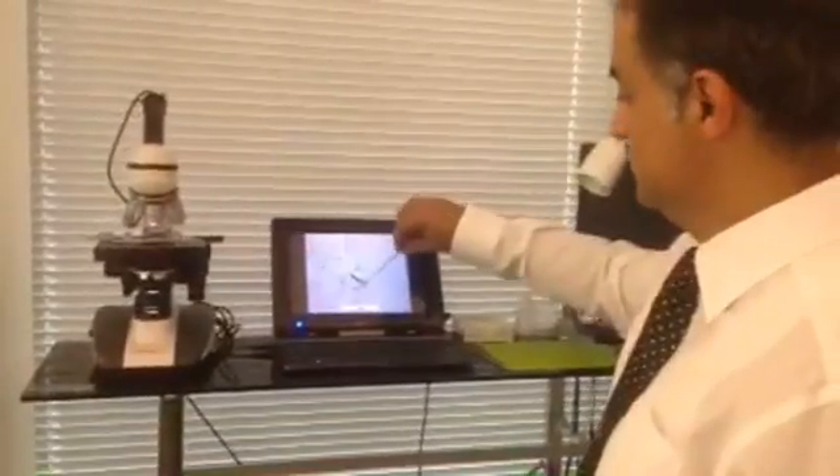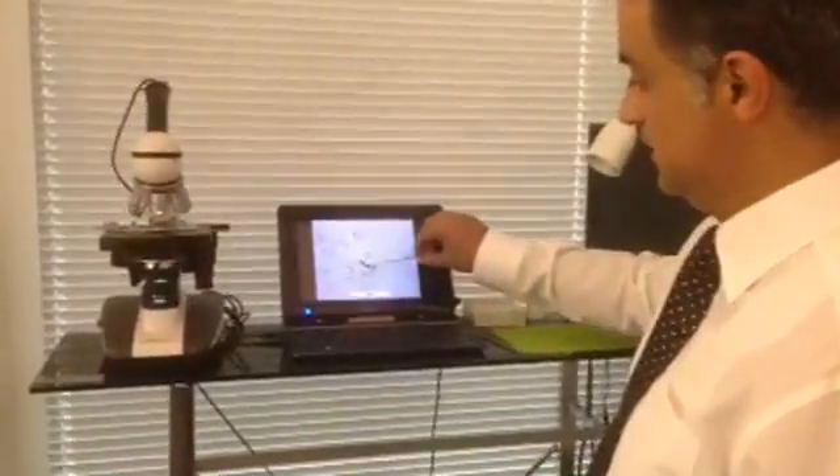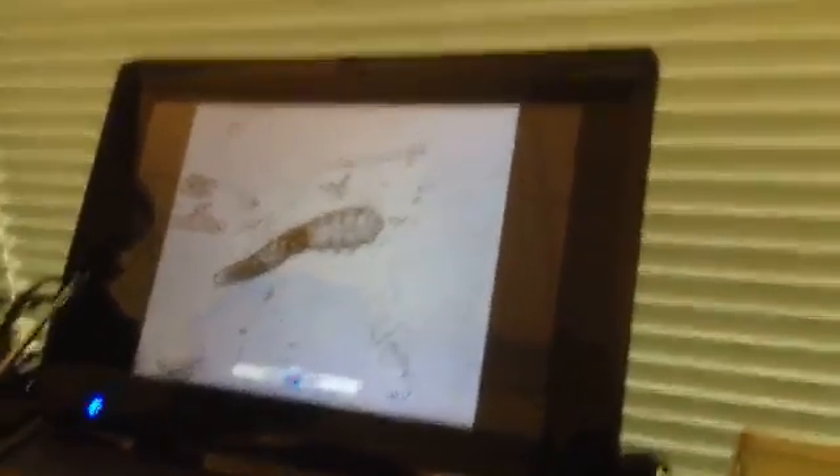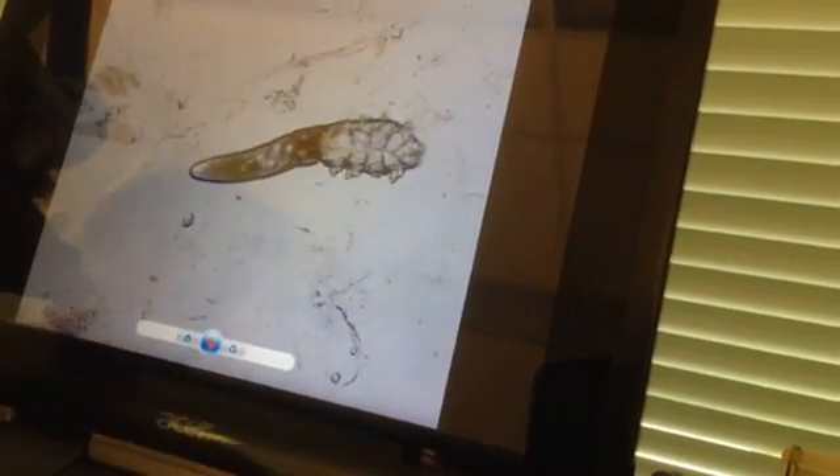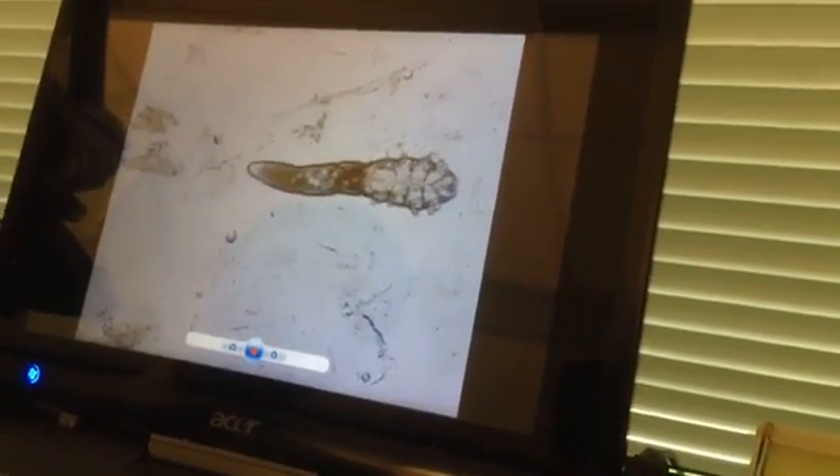From the scalp of one of my clients that's moving now — you can just see that eight legs, and they're trying to hit the seven. You can see how fast the stomach tries to walk with eight sharp legs and a pin-shaped mouth. And the eggs here — that's why they're linked to a lot of different skin and hair conditions.